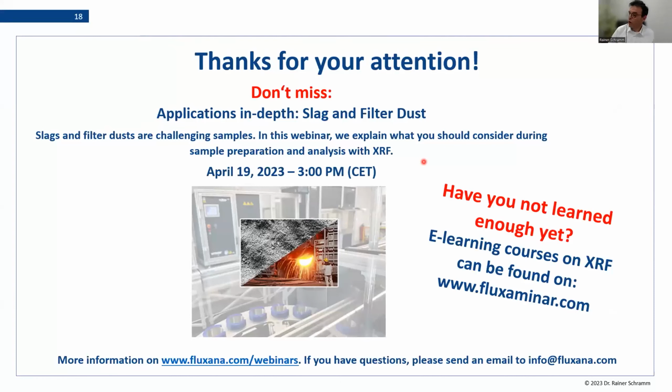Now I'm open for your questions, and I will have a look into the list here I got. So first of all, the question is, can you explain again why we don't need calibration every time?